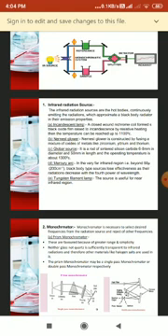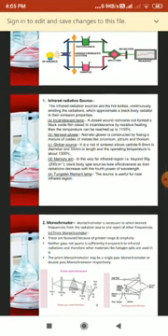They are molded in the form of hollow tubes or rods about 1 to 3 mm in diameter and 2 to 5 cm in length. The ends of the rods are cemented to short ceramic tubes for mounting, and short platinum leads are provided for power connections. The third radiation source is the globar source.